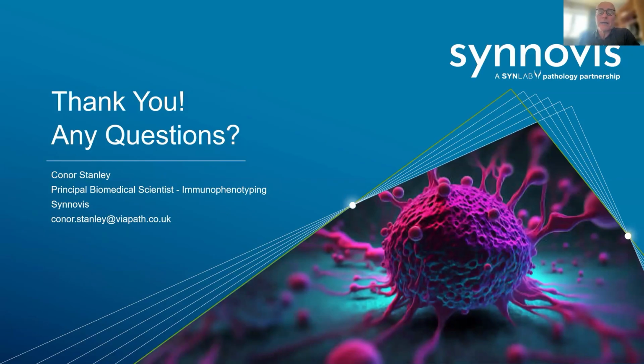Yeah, I was going to say, they sound like more expensive options. My general experience with plug and play machines is that it's very easy to just think, I'll get the answer out. But as with any bit of kit, there are always problems. There are definitely things, a bit like your APML that wasn't an APML, which you can misdiagnose with plug and play systems if you don't fully understand them. Correct. Yeah. I think you start small.